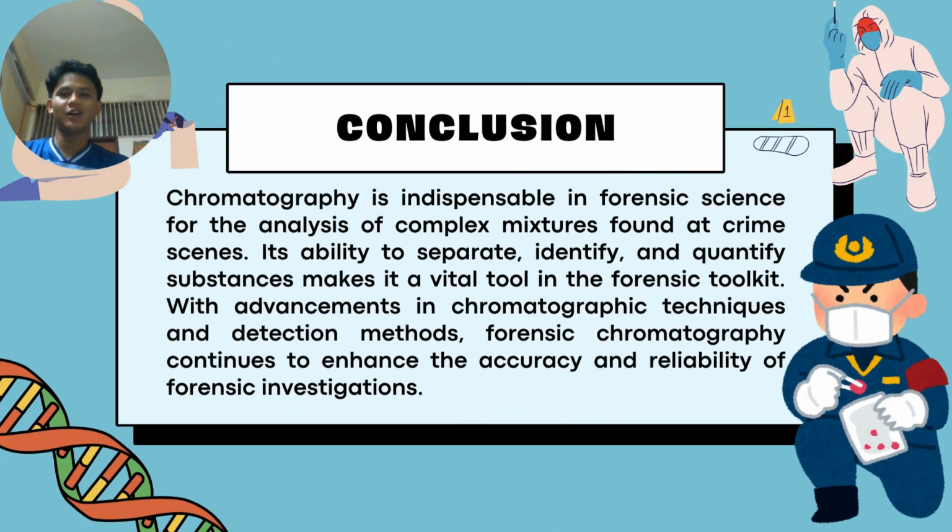For the conclusion, chromatography is indispensable in forensic science for the analysis of complex mixtures found at crime scenes. Its ability to separate, identify, and quantify substances makes it a vital tool in the forensic toolkit. With advancements in chromatographic techniques and detection methods, forensic chromatography continues to enhance the accuracy and reliability of forensic investigation.